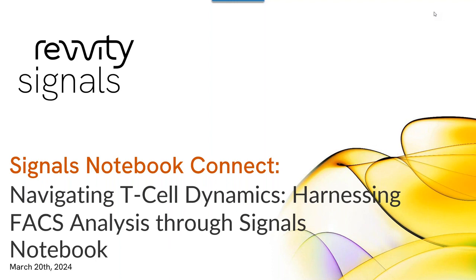This ongoing Signals Notebook community series will be an opportunity for you to learn about newly added Signals Notebook functionalities and hear how others are using Signals Notebook to improve productivity and data transparency through enhanced collaboration. As always, we want to hear from you. If you were at our last Connect, we had a suggestion regarding flow cytometry, which leads into our current Connect today based on navigating T-cell dynamics, harnessing FACS analysis through Signals Notebook.